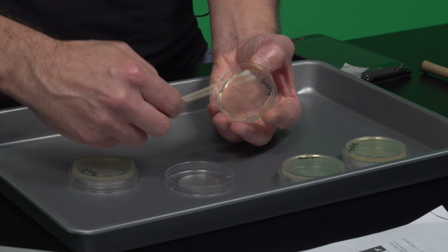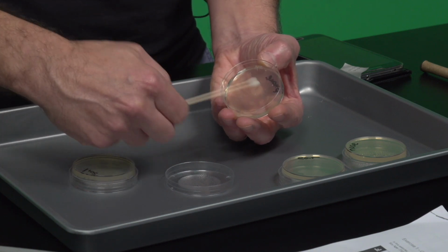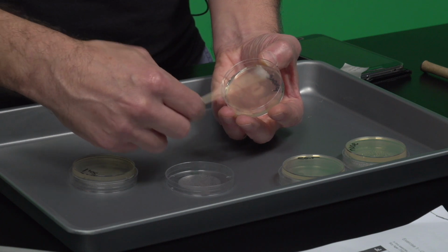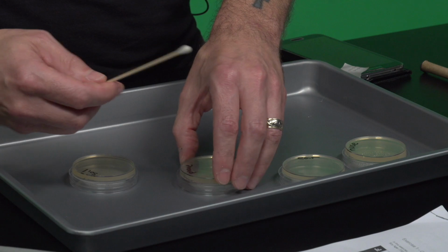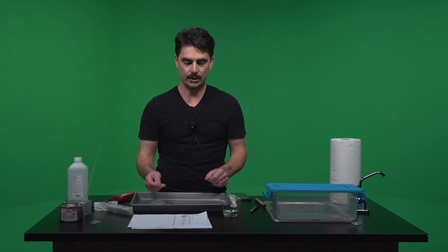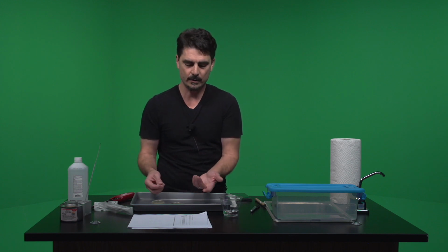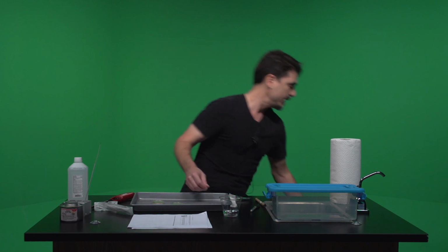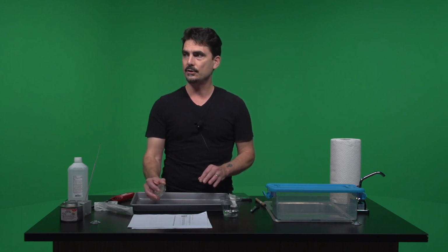So for the first set of experiments for this lab, you're getting used to it, and I understand that. So do what works best for you. Now we have the phone squared away. This was just the phone, so this can just go in the regular garbage. This didn't come from a human sample. It was just my phone. So I'm just going to go ahead and throw this in my garbage. And now we're going to go ahead and do the soil.